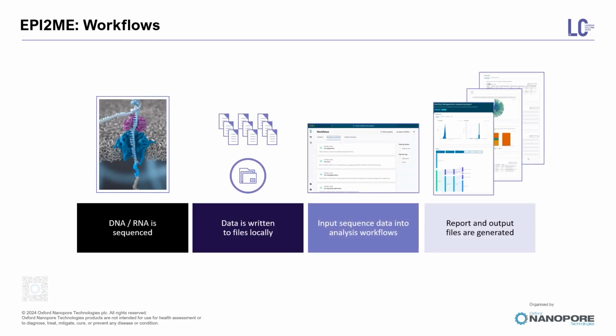So our goal as a team is to create workflows and the infrastructure needed to analyze Oxford Nanopore technology sequencing data and make it available for everyone. So our workflows take as input base call data, and they provide you with a report that gives you a first overview of your results.